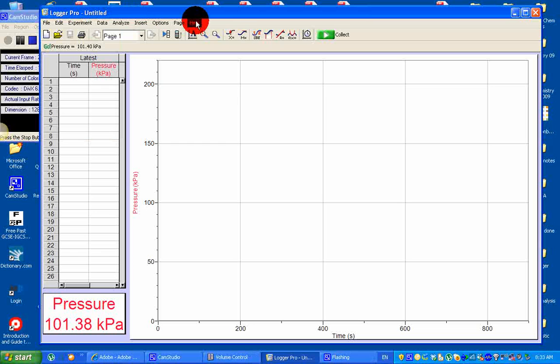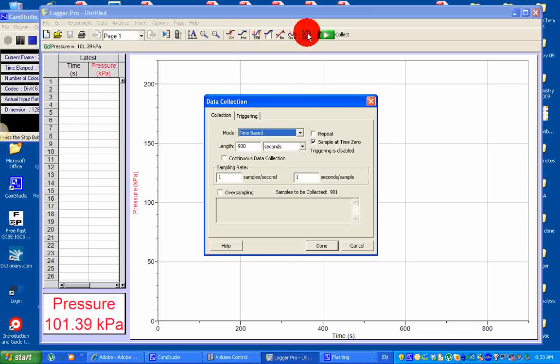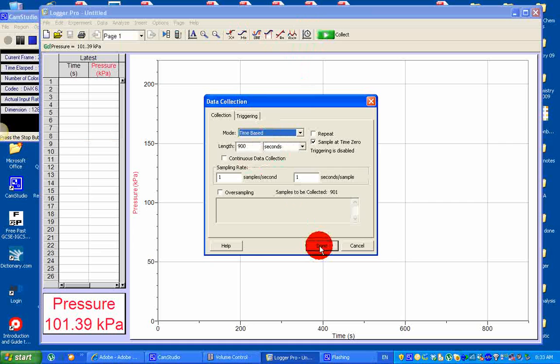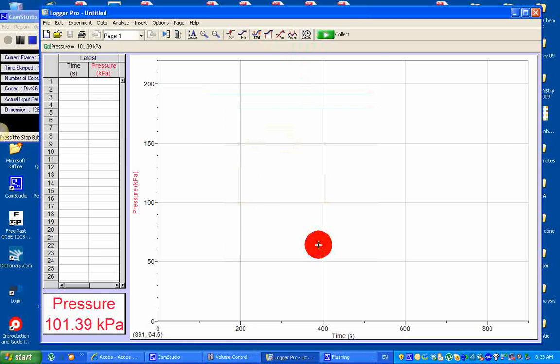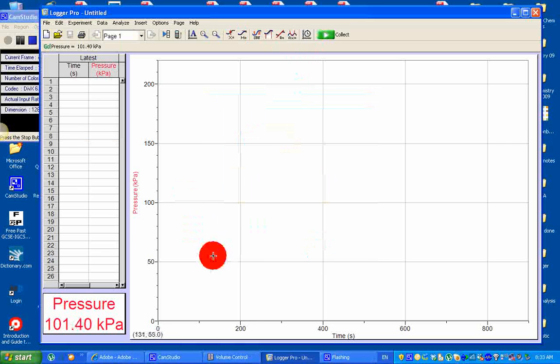Before I start, get into data collection, set the time base to 900 seconds, click on, done. I'm going to collect data for the first 900 seconds.